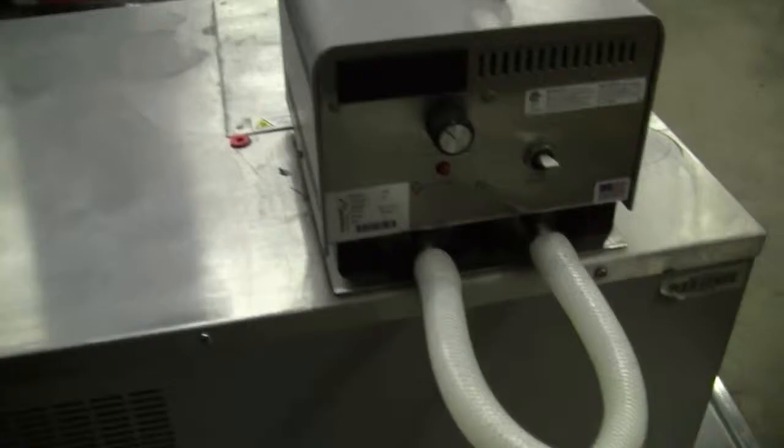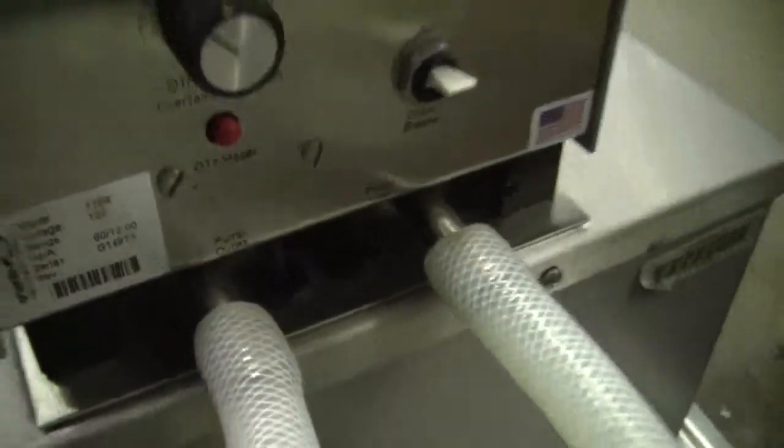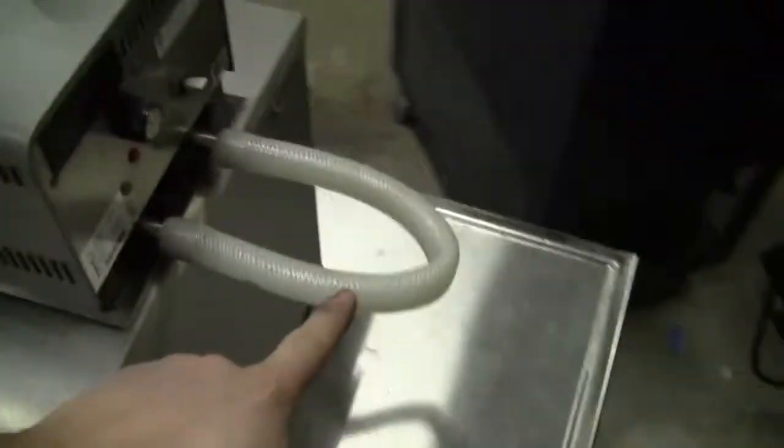Very simple configuration. The model number is 1166, 115 volts. Safety over temp, circuit breaker, recirculation loop. The loop is not included.